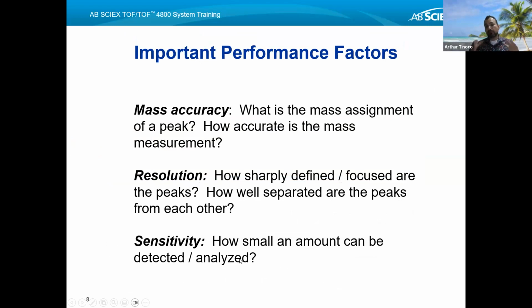So one of the beautiful things about mass spectrometry is that it is a very sensitive type of technique across the different types of techniques, instruments. But it does depend on what instrument, how accurate the mass is going to be. And I will tell you that MALDI TOF is not a particularly high mass accuracy. There are other instruments that are much better for that. But MALDI really is quite beneficial because of how quickly you can access the data and how quickly you can assess a lot of data. And when you're working with small samples, you really have the advantage of excellent resolution.